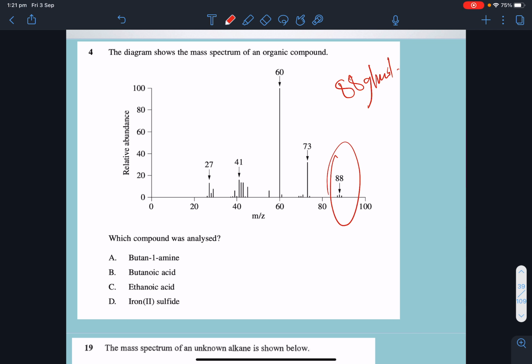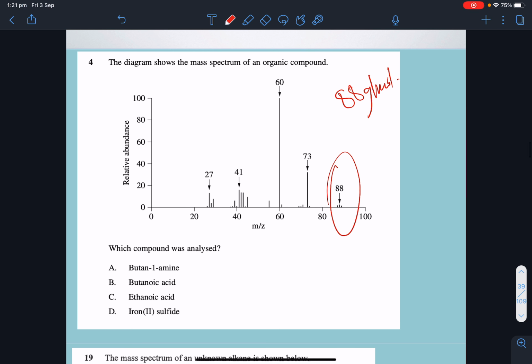Okay, so you just go through. Or should we work it all out? Have I got a calculator here? Why didn't I prepare? Okay, it can't be iron 2 sulfide because we usually don't put inorganics, we can, but it's only got the two things in there.